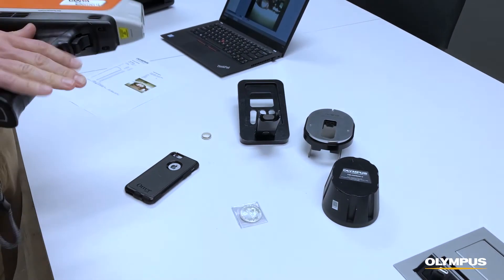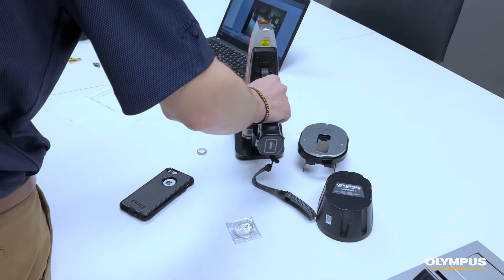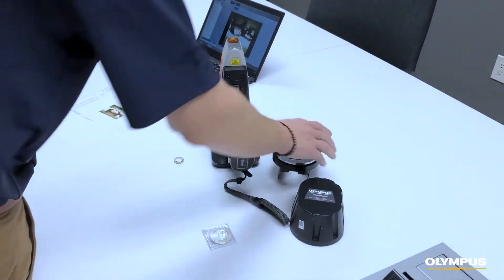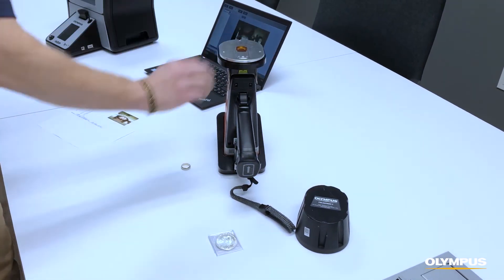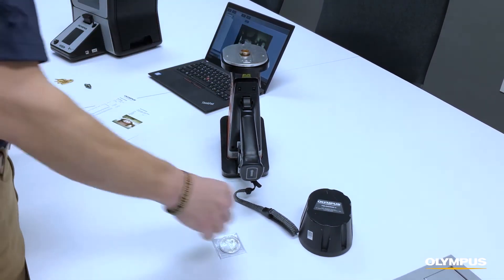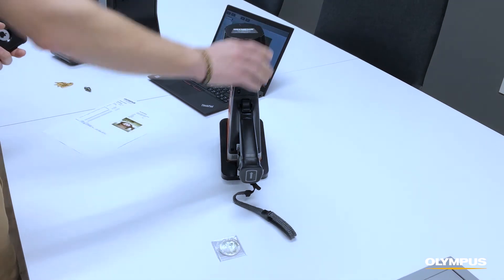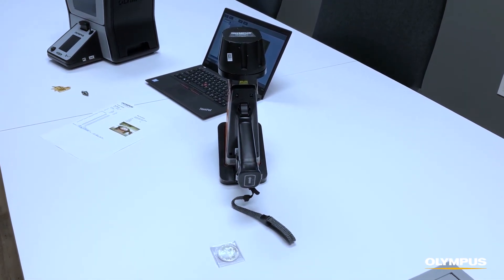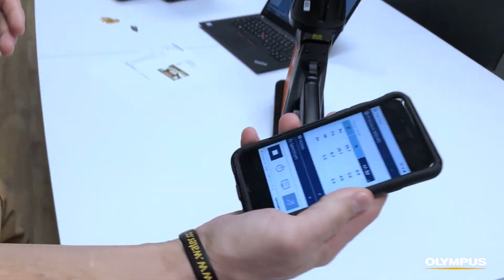If you want the best of both worlds — handheld and mobile but also the benefits of a stand for small samples — you pair this with our field stand. Simply place it on the field stand, put the sample on the base platform on top, and cover it, and you can start the test.